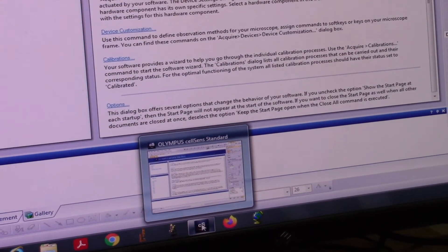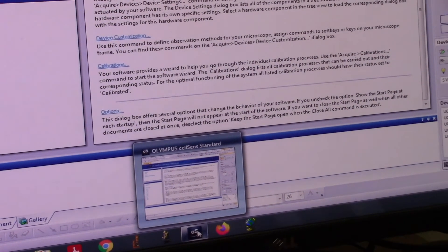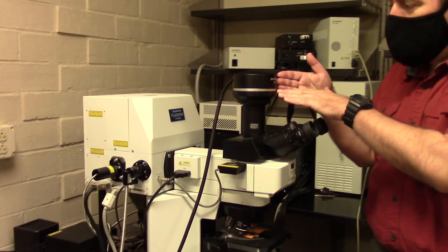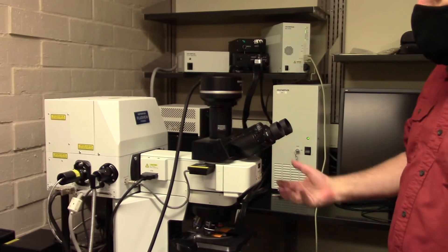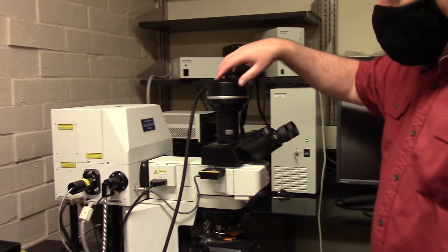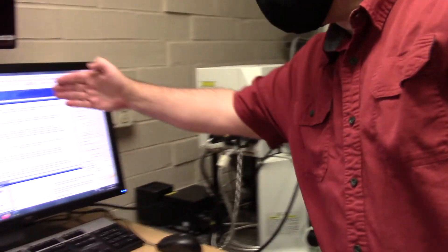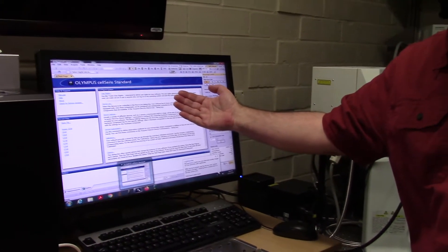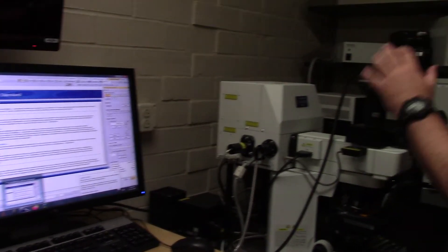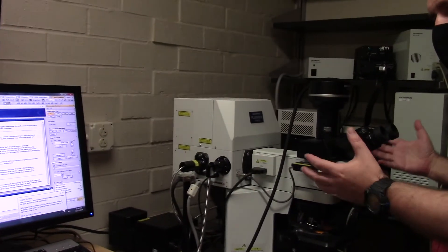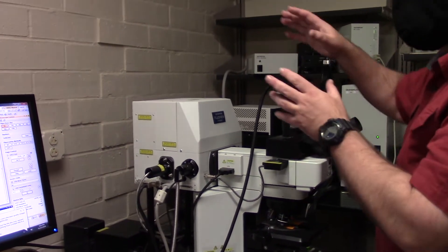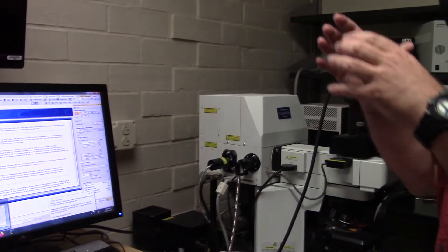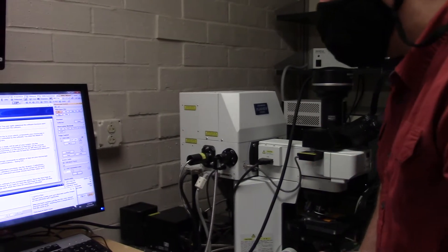This is a program made by Olympus. Olympus makes our DP-71 camera that I lectured on in lab. This is a camera that turns the photons coming in into digital that we can then see here on the screen. So we're gonna see all the different colors that we want to examine on our tissue sections using a pillar of light which we call epifluorescence.